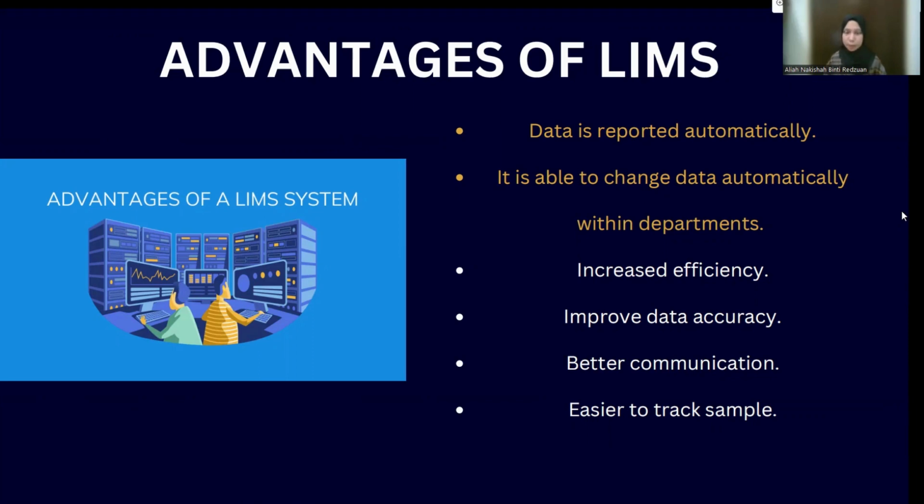For example, a patient's lab test result from the hematology lab can be transferred to another lab by this LIMS. The next one will be increased efficiency.